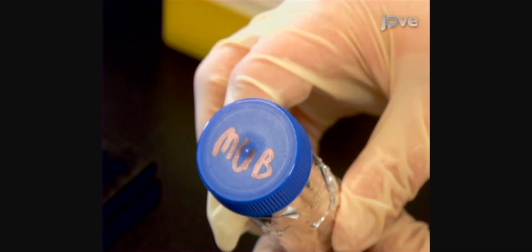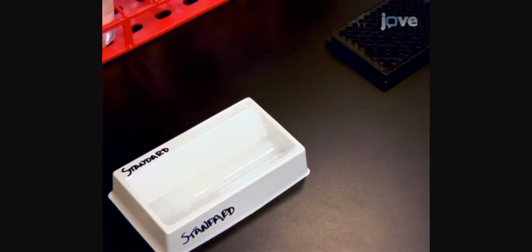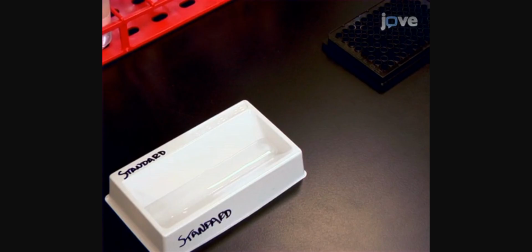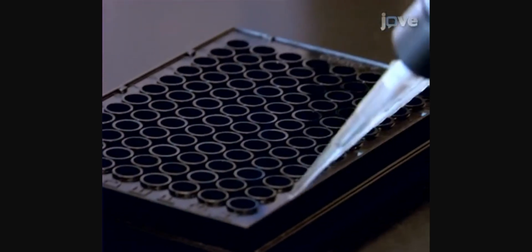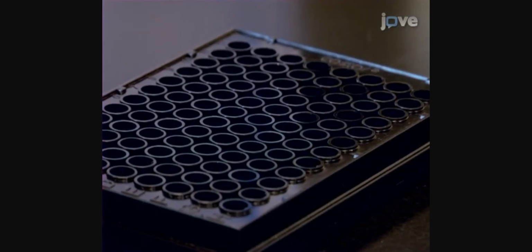Although light is kept bright in this demonstration for filming purposes, ambient lighting should be reduced by dimming or turning off lights, as the fluorescent standard is light sensitive. Pour approximately 5 milliliters of 10 micromolar 4-methylumbelliferone, or MUB, into a clean pipette reservoir. Pipette 50 microliters into microplate wells 1 through 12 in row H.